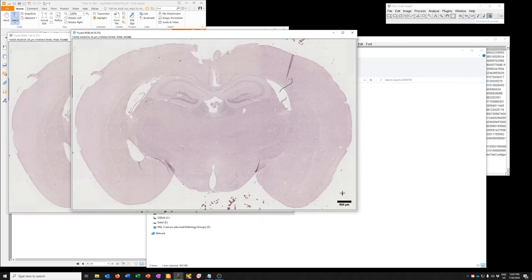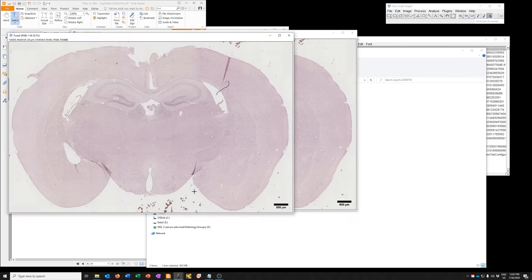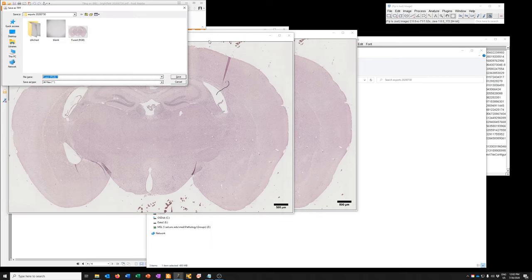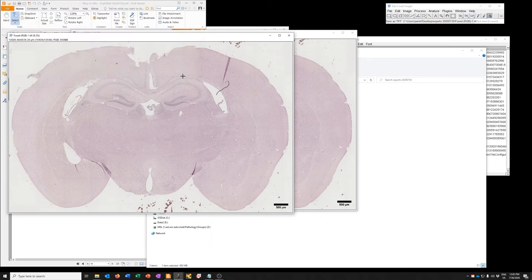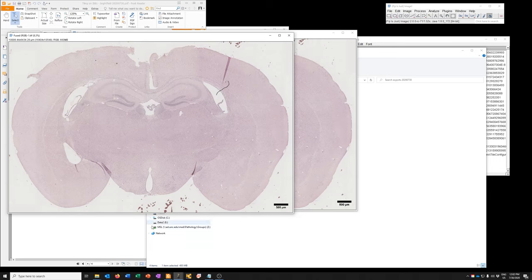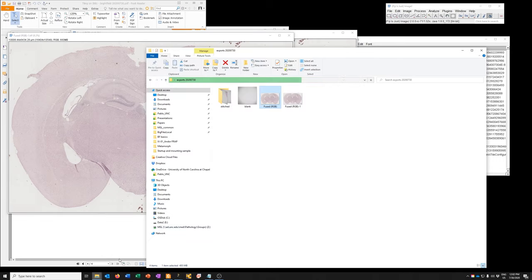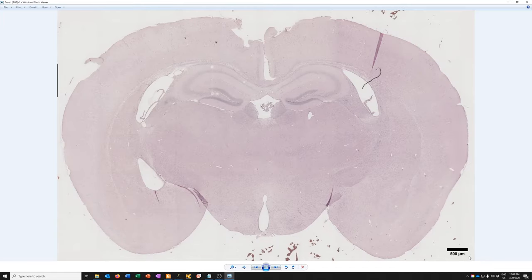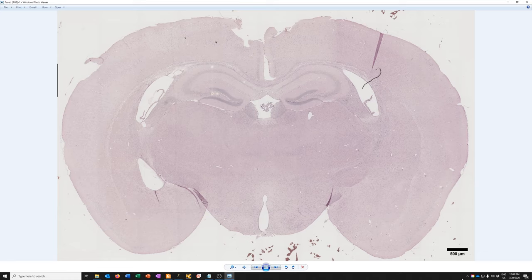Okay, so now this has been embedded into the image. So if I save this one, and then look at that image. If I double click on it, now you can see that the scale bar has been embedded into the image. All right.